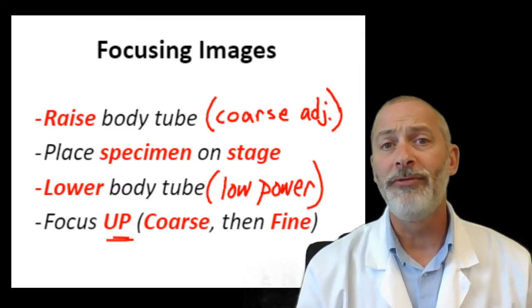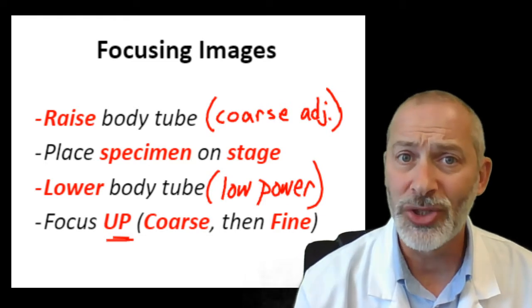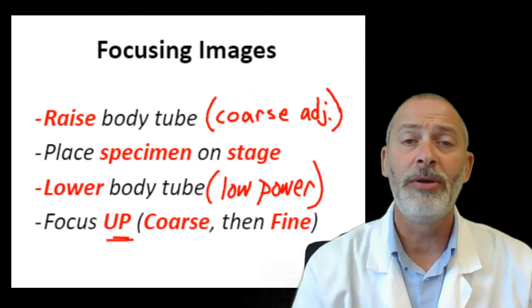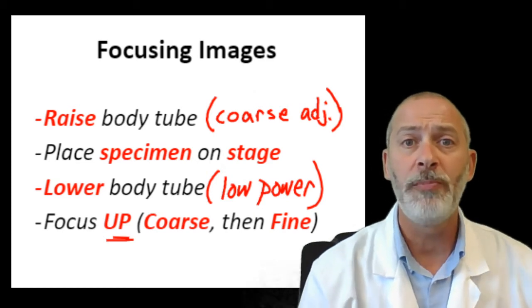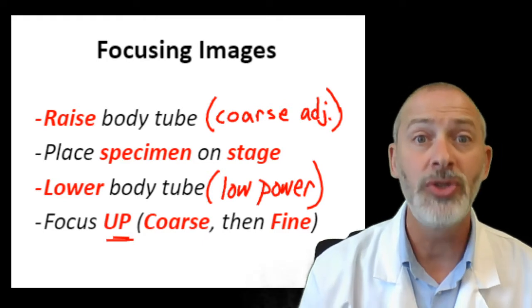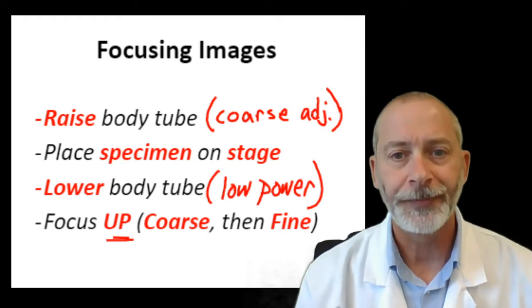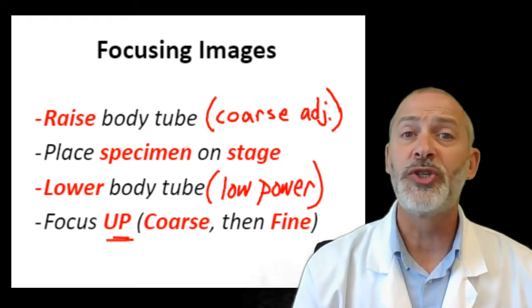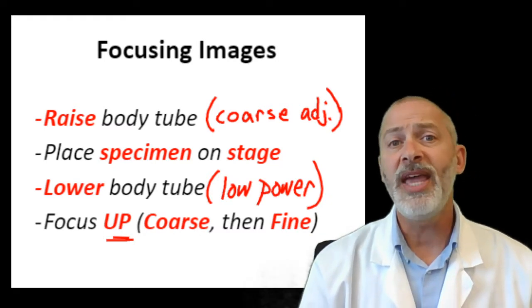Now, as we go over this list, it may not make a lot of sense to you yet, but once I show you, we go into the lab here in a moment and check out the microscope and refer to the different parts of the microscope, and I show you how it's used, it's going to make a lot more sense to you. Second step on this list is place the specimen on the stage.